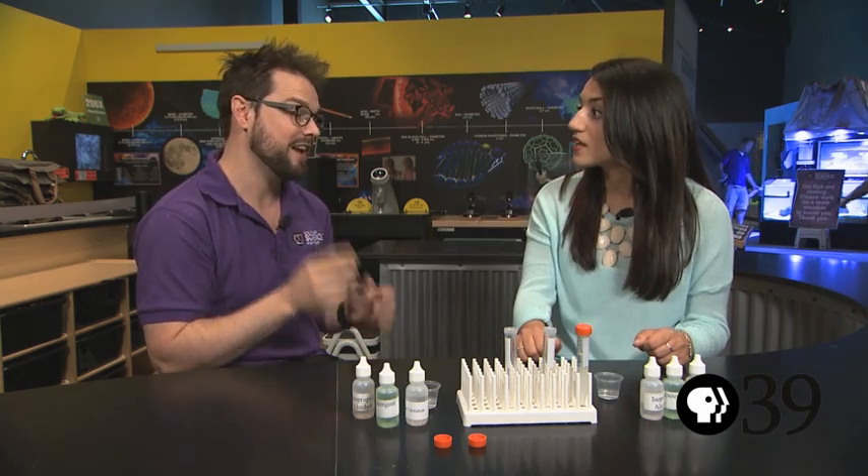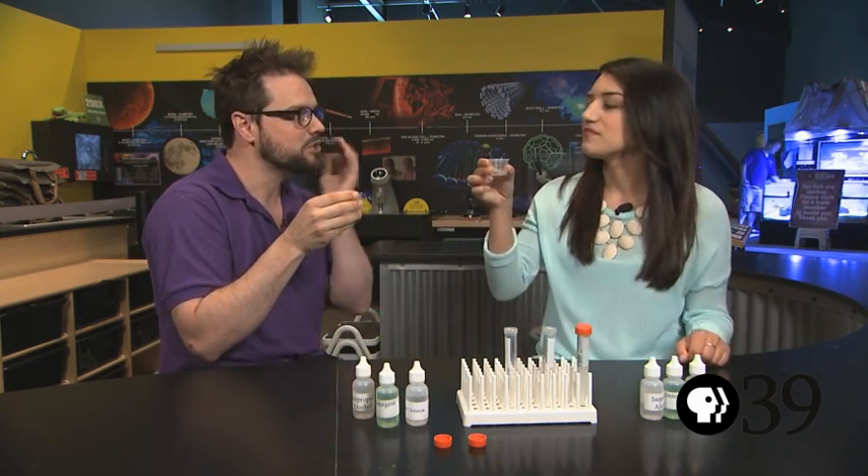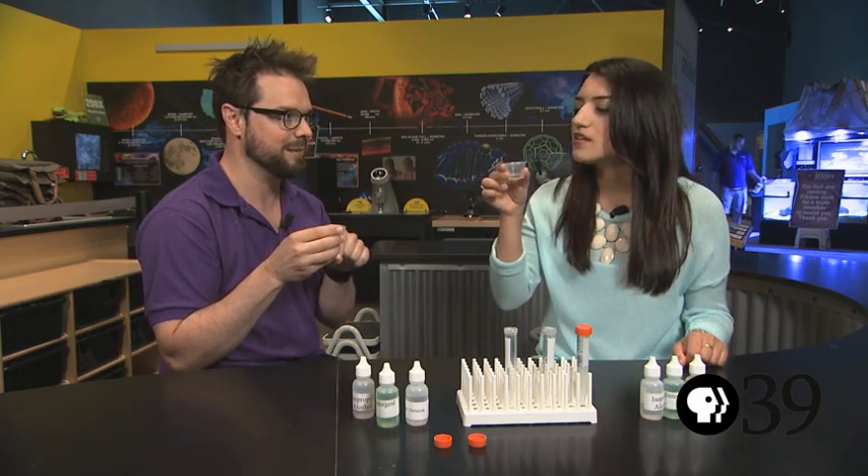So this is where it gets fun and really disgusting. What we're going to do is put a little bit of water in your mouth, swish it around for a minute and then spit it back into the cup.